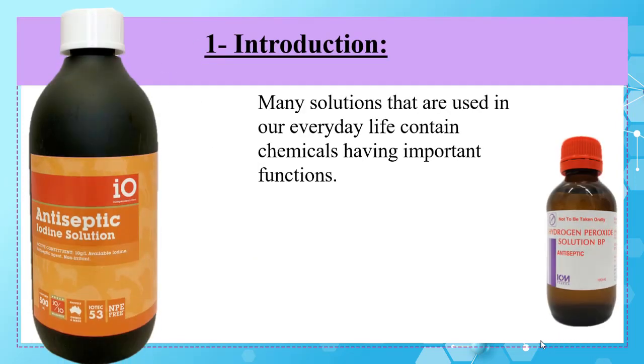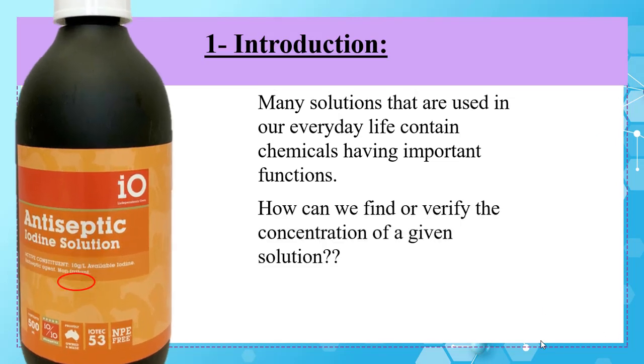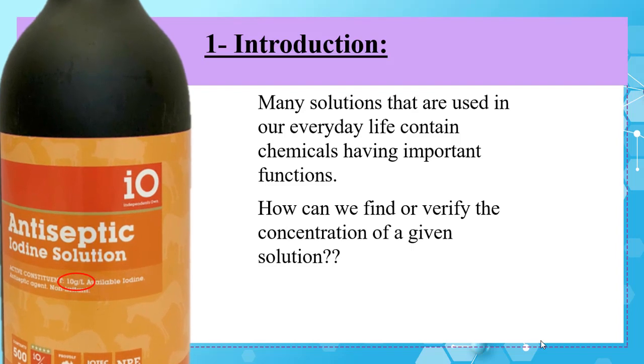Many solutions that are used in our daily life contain chemicals having important functions. However, how can we find or verify the concentration of a given solution? In fact, this can be determined using a volumetric titration.